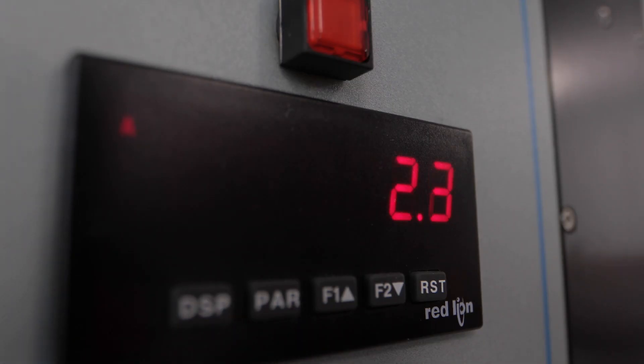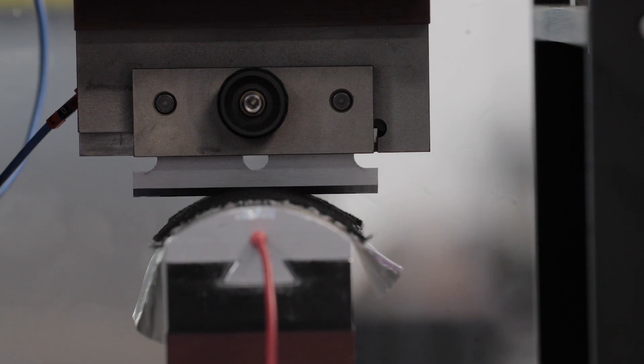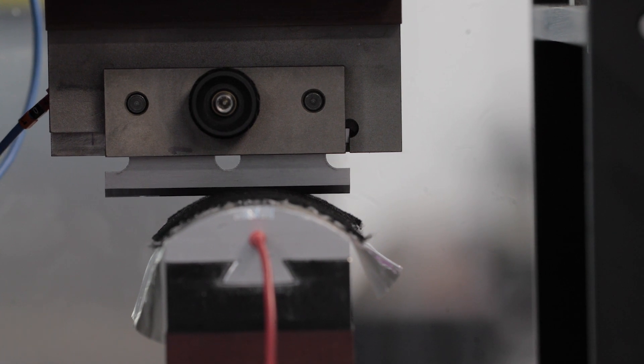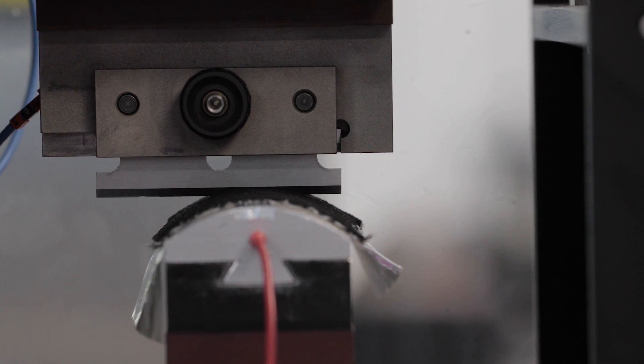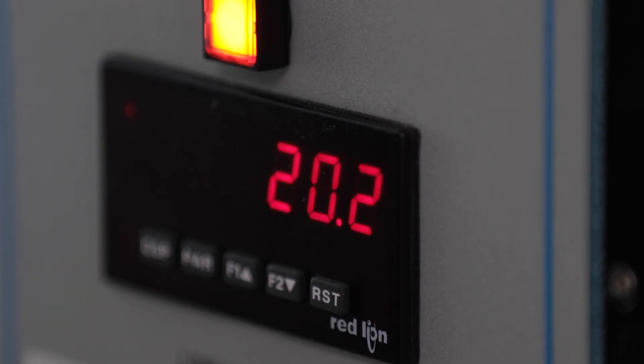And the distance moved by the blade is recorded. In this example, the glove resists being cut through by the blade until it is cut for 20.2 mm.